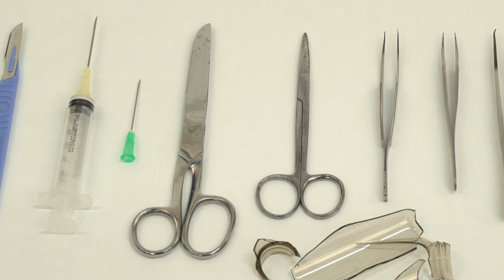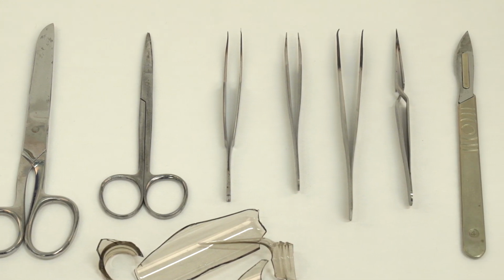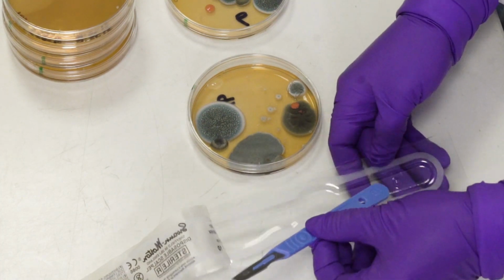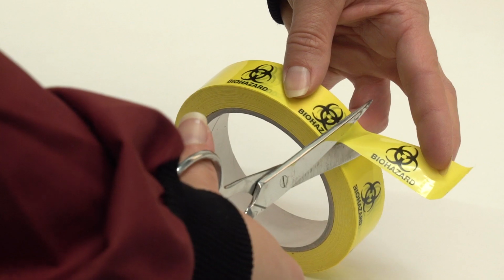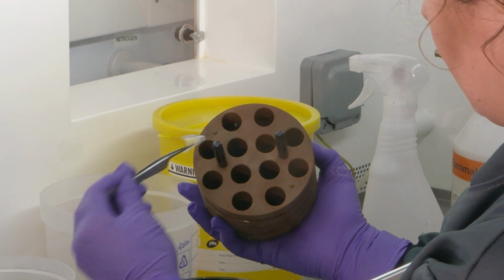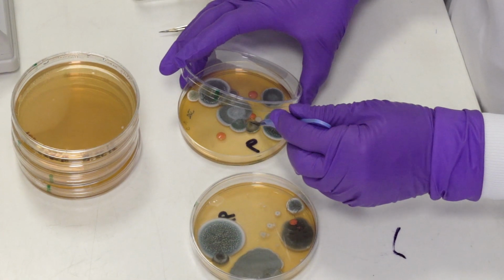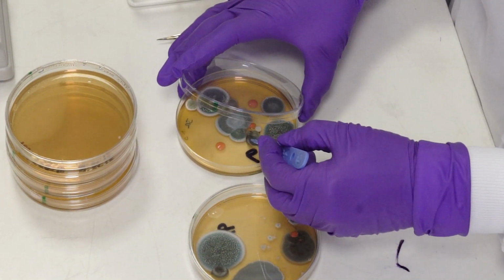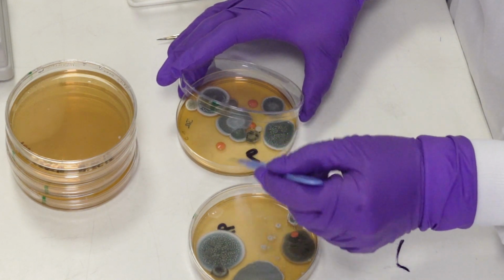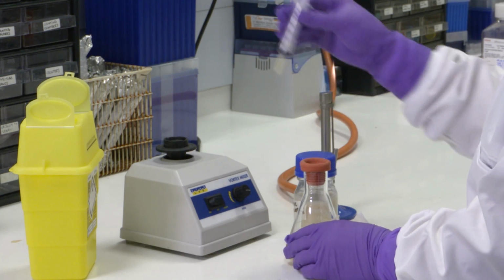Sharps refers to items which you may handle that have sharp points or cutting edges capable of piercing or cutting human skin. Typical items in the lab are scalpels, needles, scissors, tweezers, and bits of broken glass or plastic. The risk of injury is obvious, but when contaminated with biological agents, they create a greater hazard, so the use of sharps should be reduced to a minimum wherever possible. Where they are needed, they should be handled and disposed of carefully.